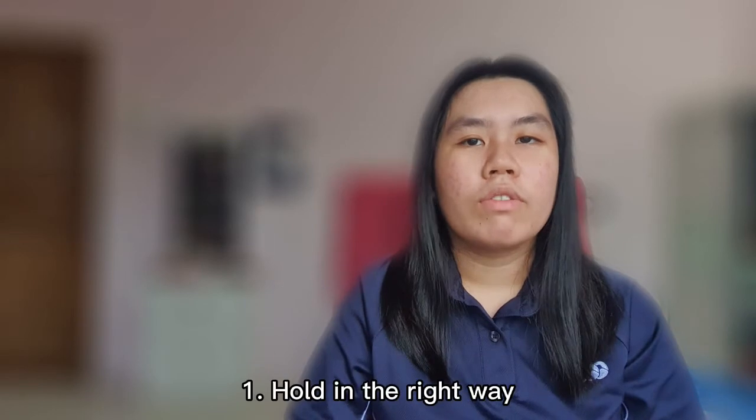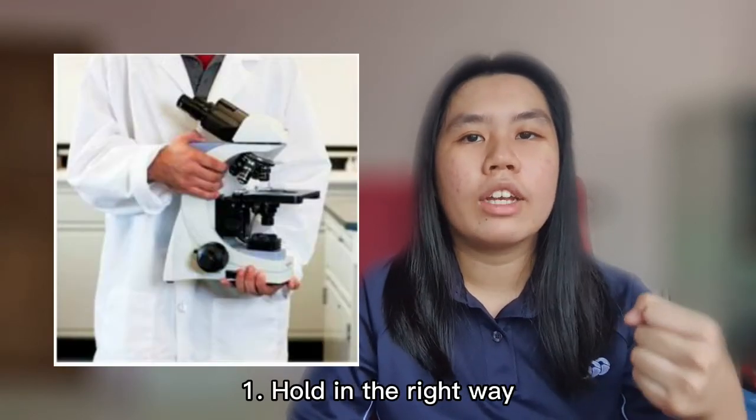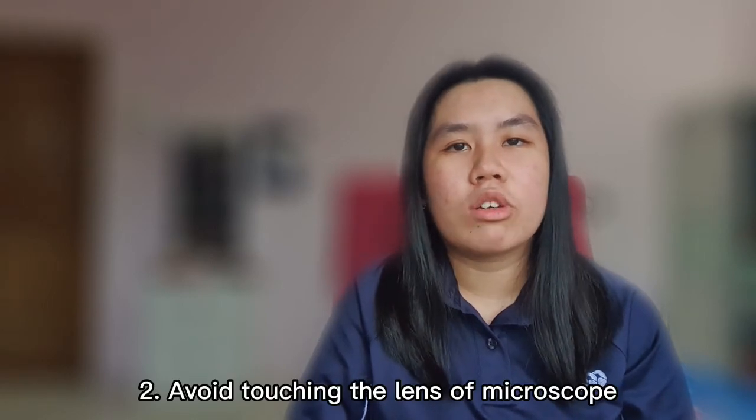This is a part for the method to handle a microscope. First, we should hold the microscope with one hand around the arm and the another hand under the base. This is the most secure way to hold and work with the microscope. The second method to handle a microscope is avoid touching the lens of a microscope. This is because the oil and the dirt on our fingers will scratch the glass of the microscope.